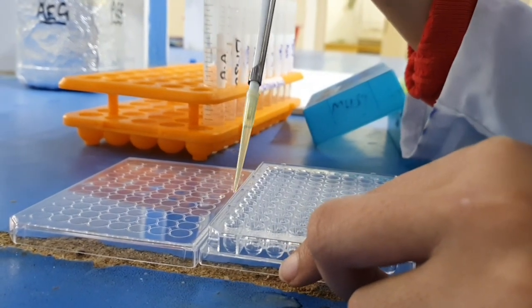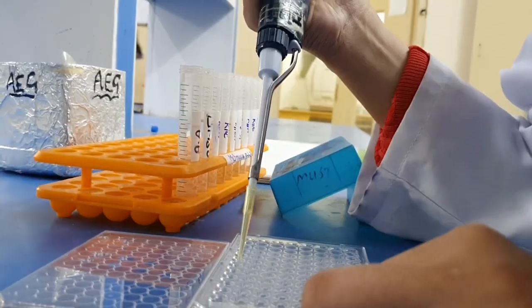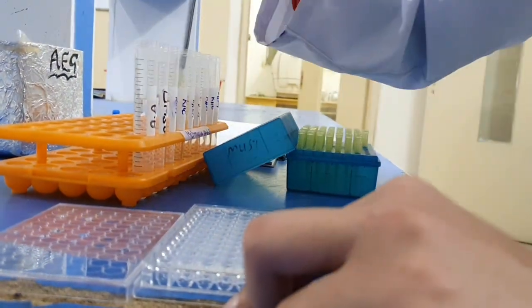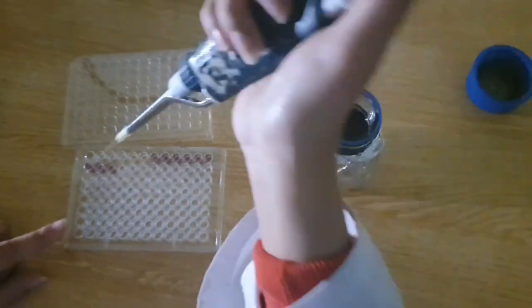And now we are adding the respective concentration of our samples according to the labeling in the microtiter plate. Afterwards, we will add DPPH. DPPH is added in the dark because it's light sensitive.